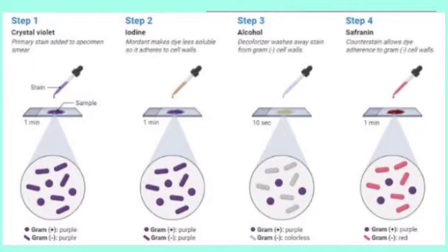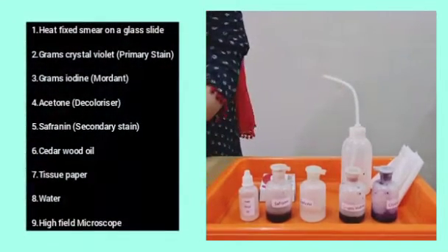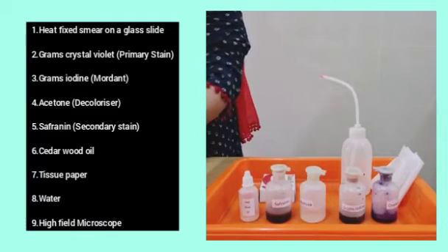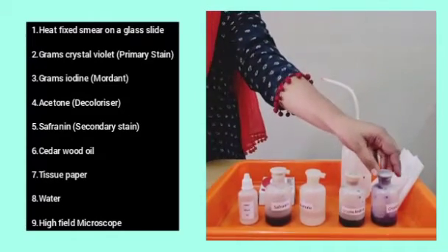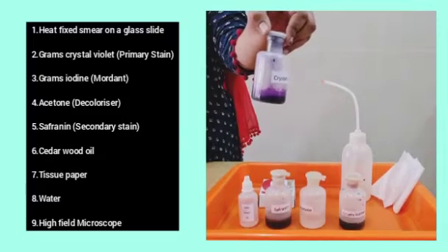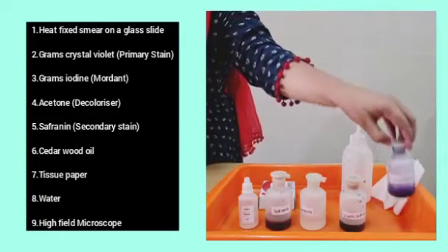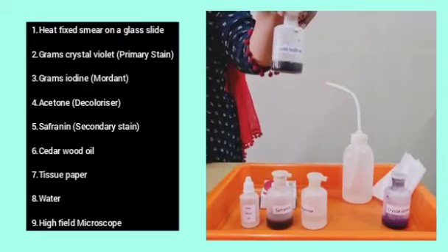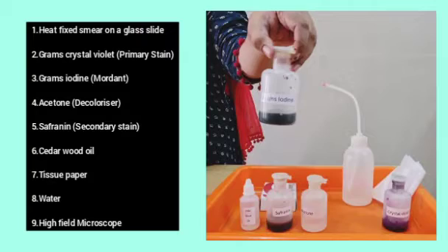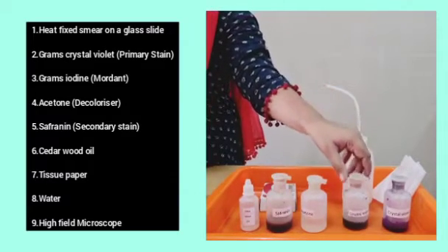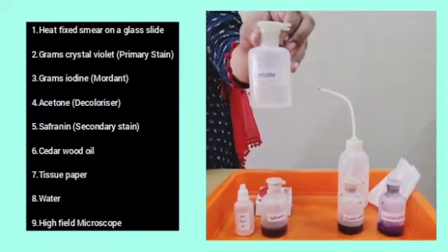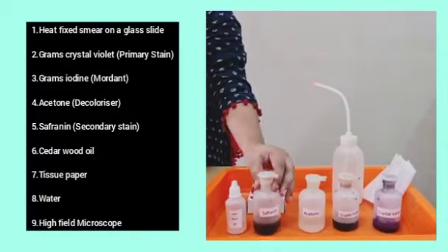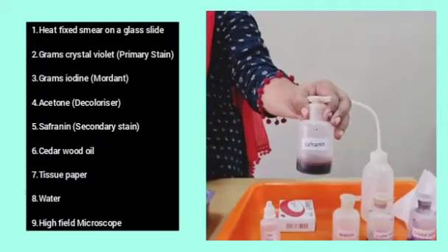Now, the requirements for gram stain. Number 1: Heat fix smear on a glass slide. Number 2: Crystal violet which is a basic dye and it is a primary stain used. Number 3: Grams iodine which is a mordant that is a fixative of the primary stain. Number 4: Acetone, it is a decolorizer. Number 5: Saffronin which is a secondary stain or a counter stain.